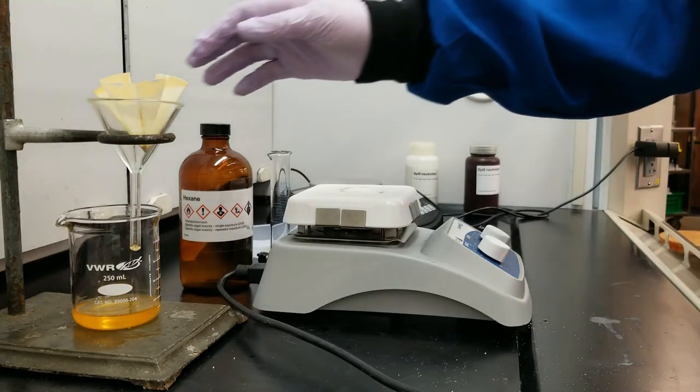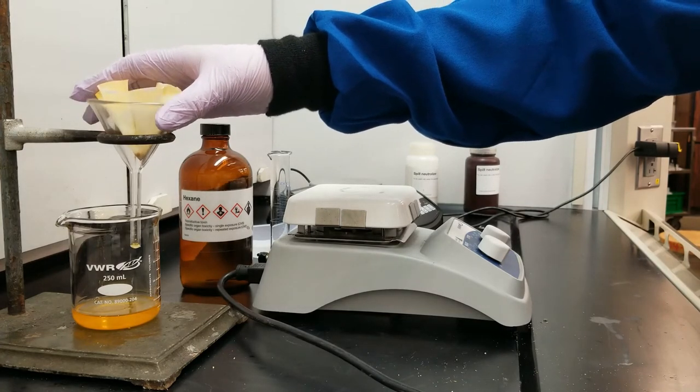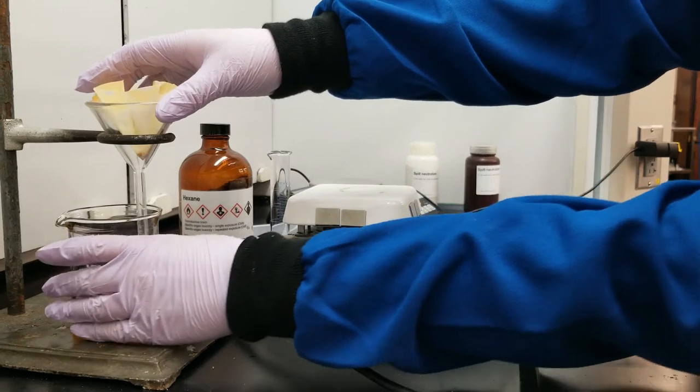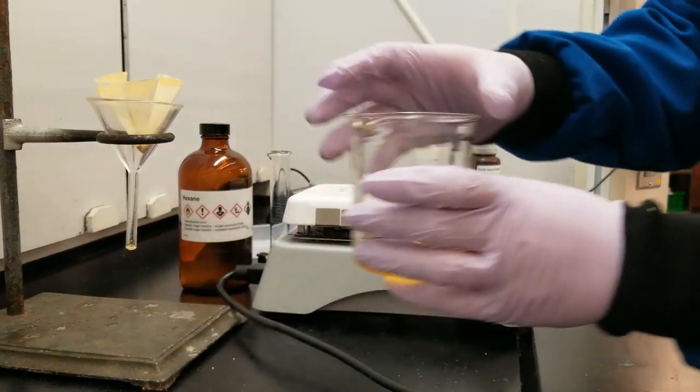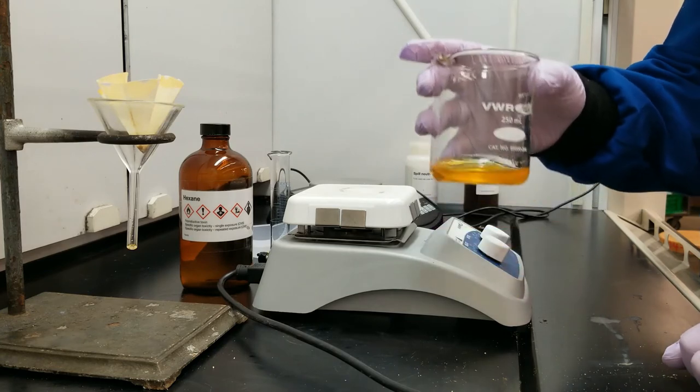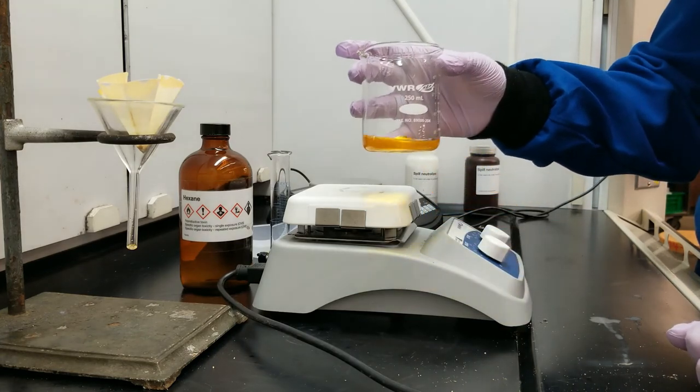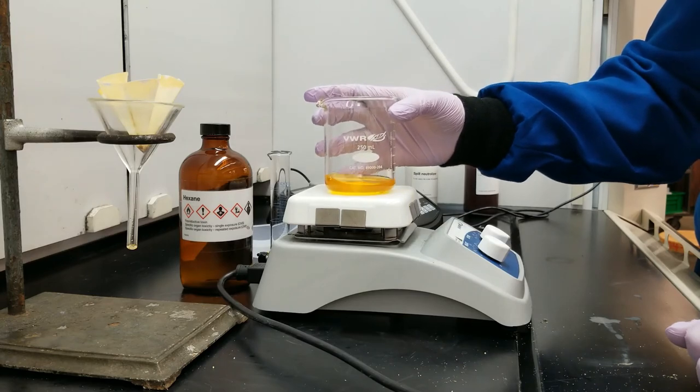So it looks like my fats and hexane are done filtering. So I'm done with my filter apparatus. The next thing I'm going to do is take my beaker with my fats and hexane and I'm going to gently heat off the hexane, which will take a little while but not very, very long because hexane is very volatile.